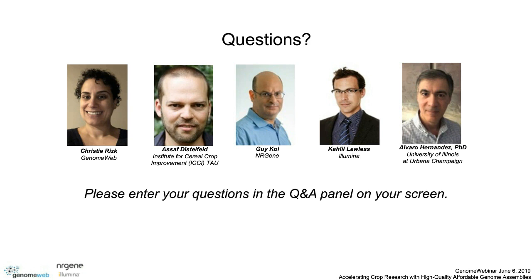Asaf, a question for you. Have you tested the quality of the de novo MAX assemblies in regions other than BTR1? That would be a question for Guy. Yes, actually, I will answer it. We did test other regions too, and we also compared it to optical mapping data, and the results are very satisfying.